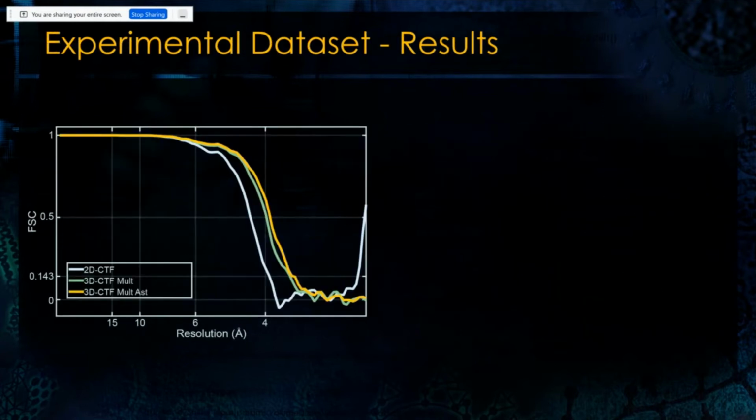And when we ran the analysis with the new starting positions and with the same amount of data, we really ended up with an improvement. We also tried phase flip, to be fair, because originally I said that this data set was corrected with the phase flip technique, and we tried phase flip.